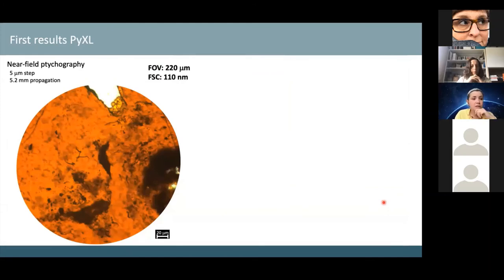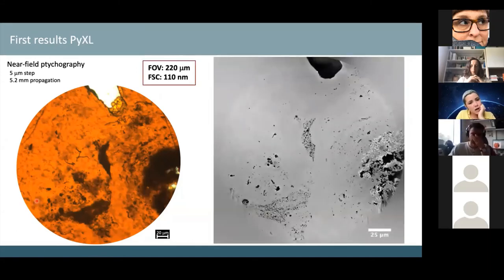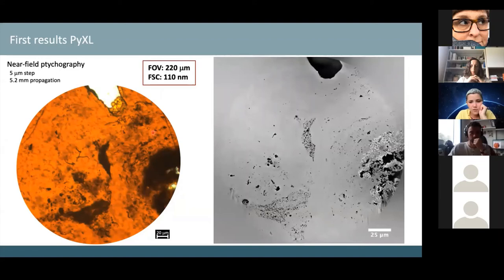Using far-field ptycho-laminography, we achieved a 70-micron field of view with 410 nm resolution. We identified the fossils, examined them in context in 3D, and found additional structures not seen before. With near-field ptycho-laminography, we achieved a 220-micron field of view with ~110 nm 3D resolution estimated by Fourier Shell Correlation. This revealed not just fossils but a much larger geobiological context — we could segment different filaments, observe diverse morphologies and dimensions indicating multiple types of microorganisms.